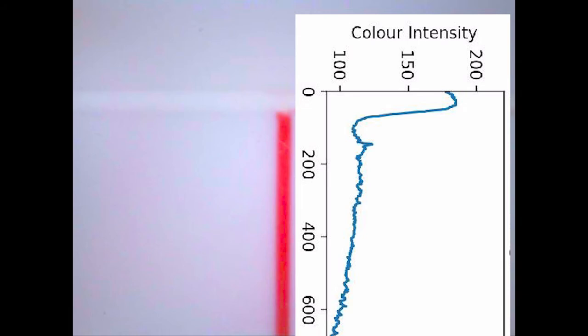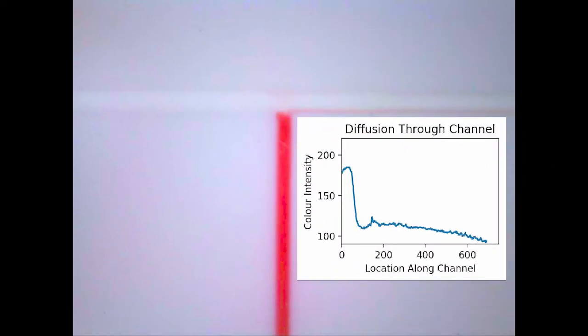The flow is stopped and we plot the color intensity along the vertical channel to determine the relative concentration of pentane in the oil. We can watch this plot in real time as the two fluids now begin to mutually diffuse along the channels.